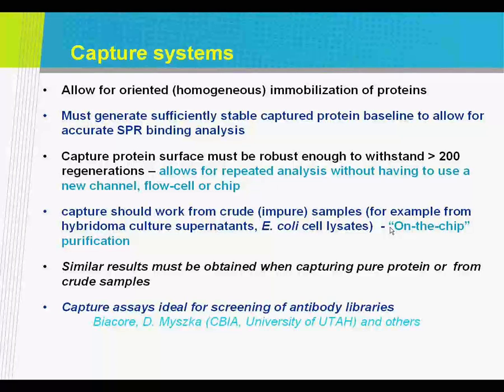Well, we could do this capture of the full antibody. So this shows the full antibody here. You've got the binding site at the top, and you've got the Fc region at the bottom. And most of these capture assays with monoclonals are through the Fc region.